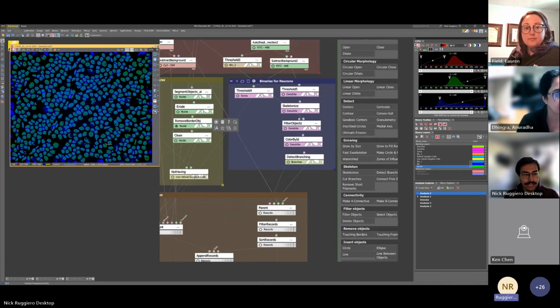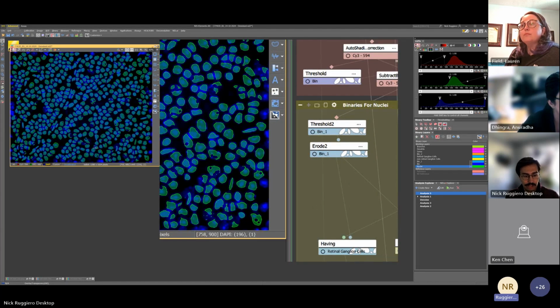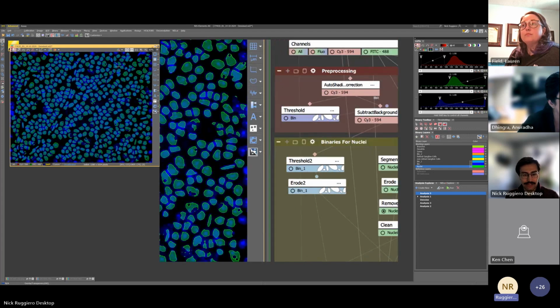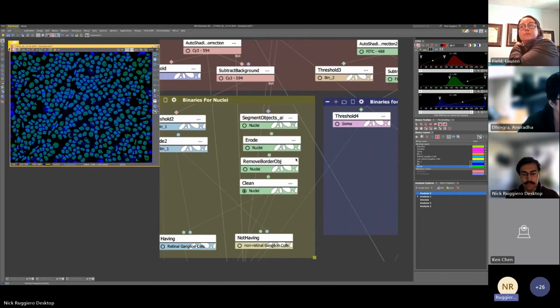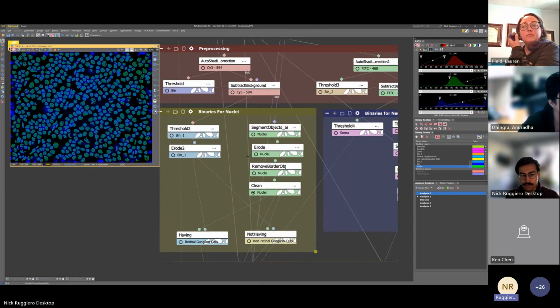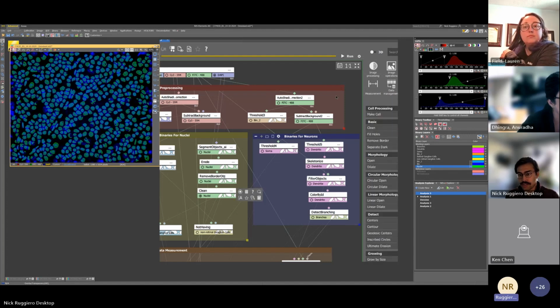And the final thing I did on this one, when I ran this erosion, I noticed that I had some little objects here that I didn't really want in my image. So I did a clean. Clean is going to be one of the binary processes that's going to live up here at the top. It's one of the first ones.